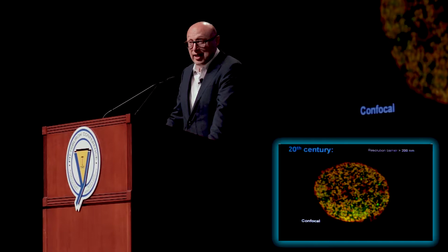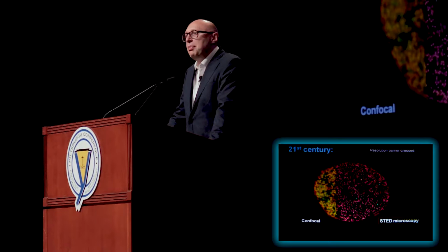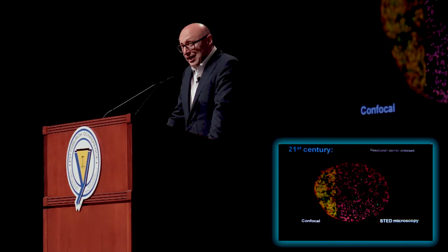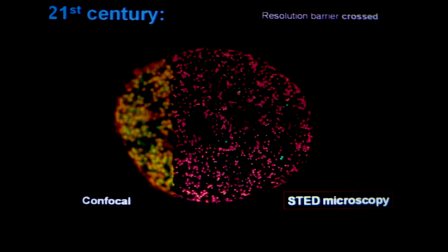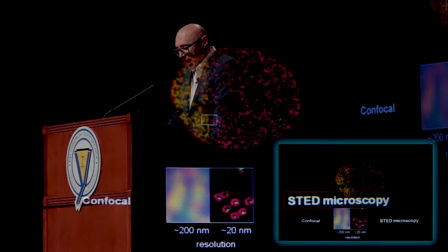Now, the turn of the century witnessed the breaking of the diffraction barrier, meaning that microscopy concepts came up that allowed much better resolution. And the first concept of this kind was STED microscopy, as you just heard. This picture shows that a STED microscope is capable of attaining much higher spatial resolution than a confocal microscope or a standard epifluorescence microscope, in this case by a factor of 10.